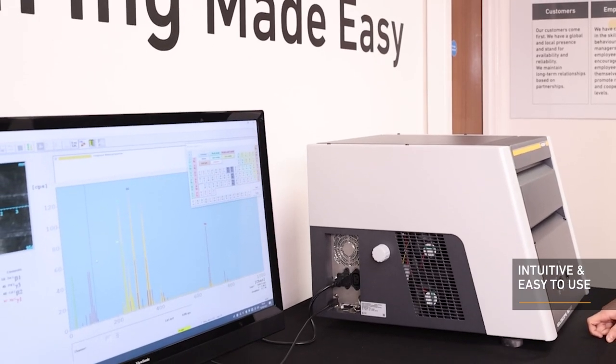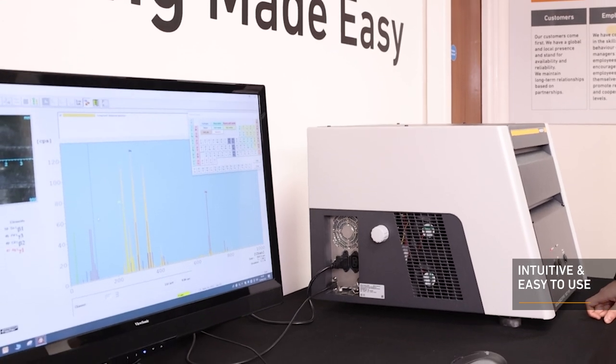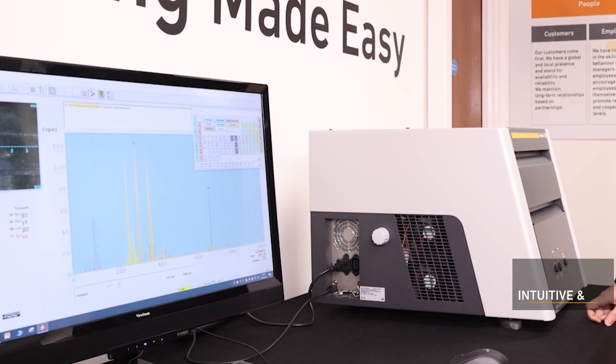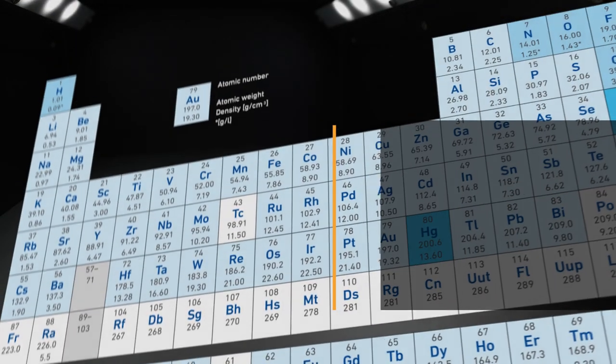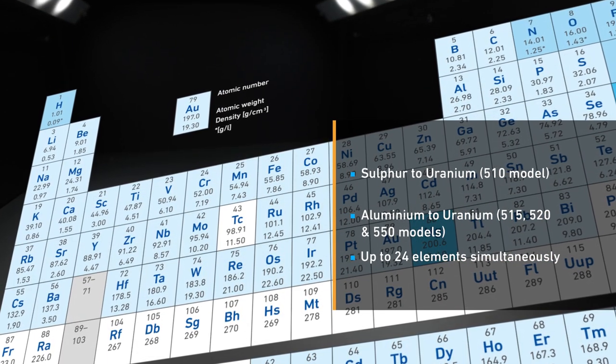Clear measurement data is gathered and stored, enabling powerful reports laid out in a straightforward way immediately. You can measure a wide range of elements ranging from sulphur to uranium.